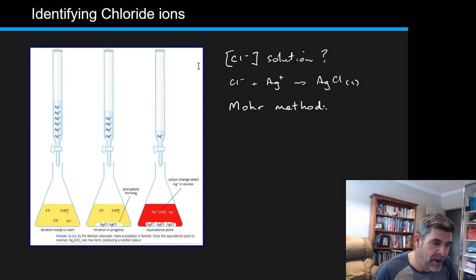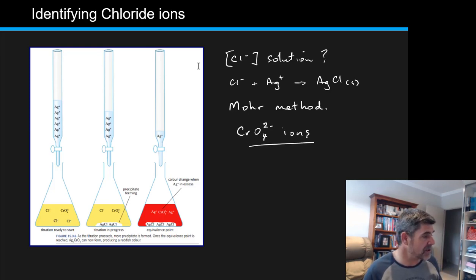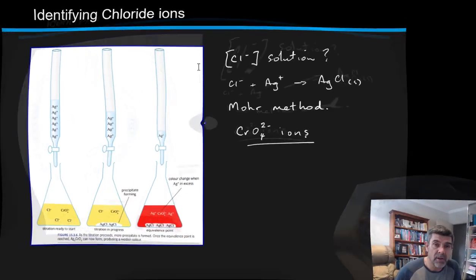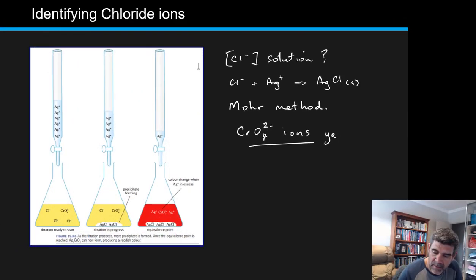So you can see the main thing that we're going to add as our indicator here are our CRO4 2- ions. And these ions are going to just slightly change the color of the solution. So the chromate solution is going to be yellow. Now we don't want to have too much of the yellow color in there because it actually may start to obscure this formation of our precipitate. So we have a precipitate forming there. The titration is progressing. We're starting to get more of our white solid starting to be produced.